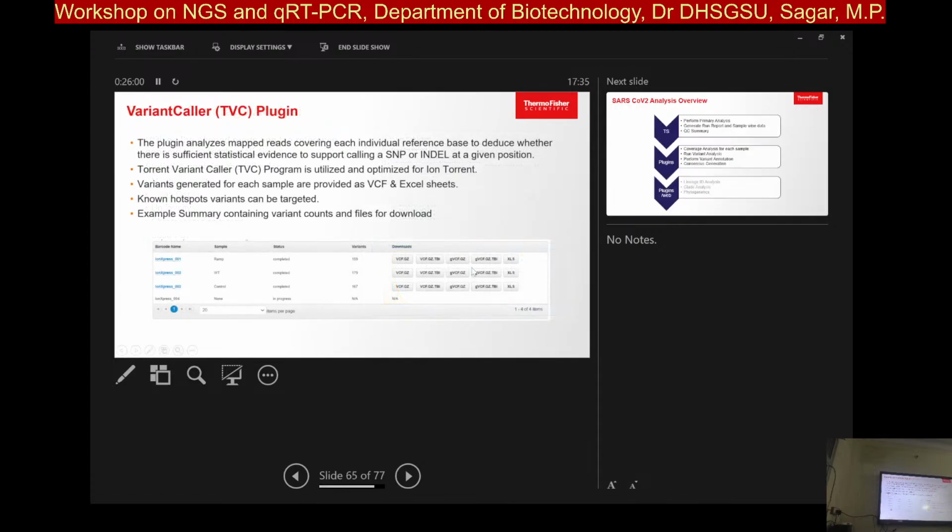Okay. So variant calls. If I'm doing any variant calls, it will take the reference, map it, and give you the results. So this happened in a virus condition. This is a sample for dengue. The dengue extractions were sequenced and aligned here. And with the sample controls that they had, they didn't take one sample. With that, it started giving me results, and it's completed. It tells me there are 159 variants coming in. So SNPs, indels, insertions, deletions: an extra insertion came in, and one got deleted.